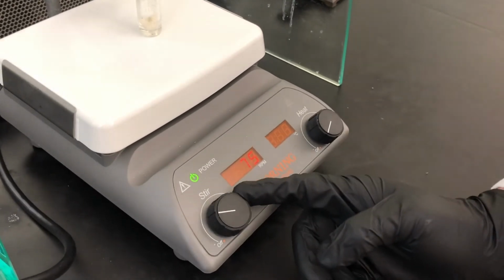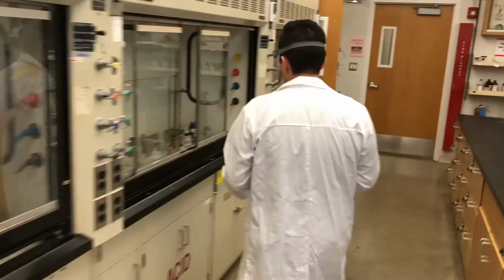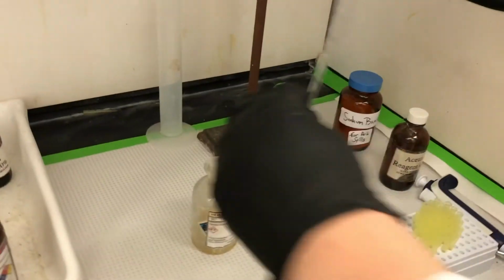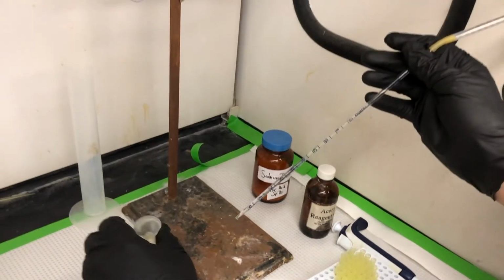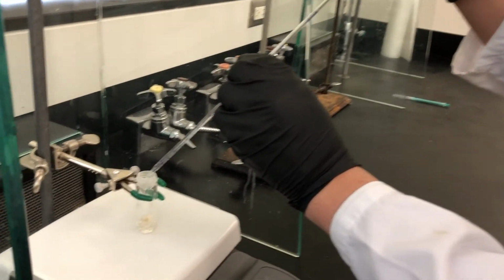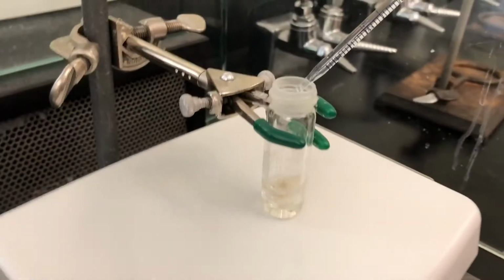We're going to stop stirring this. Now we're going to go get the 3 molar hydrochloric acid. So here's the 3 molar hydrochloric acid. We're going to get 1 ml. Cap that back up. Okay, so this will neutralize the reaction so that the sodium borohydride will no longer react. I'll just stir it a little bit.